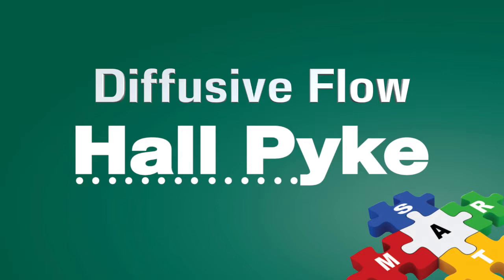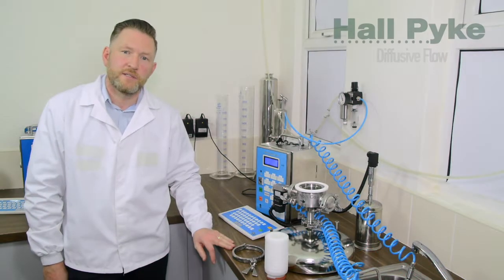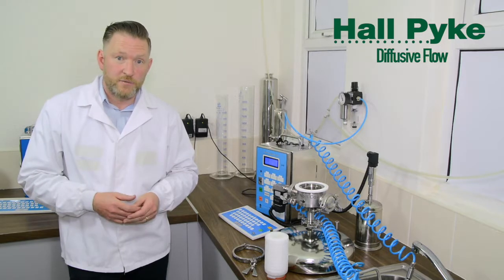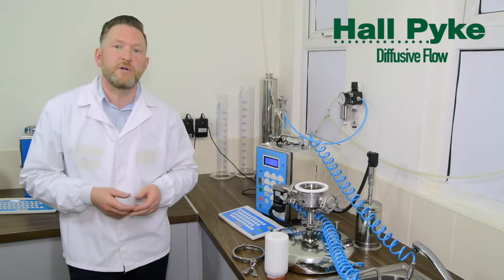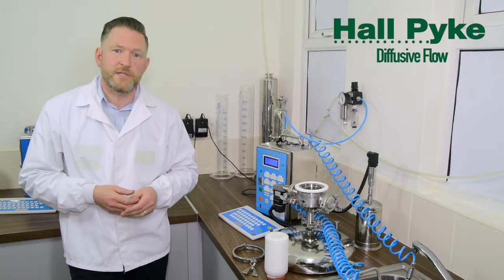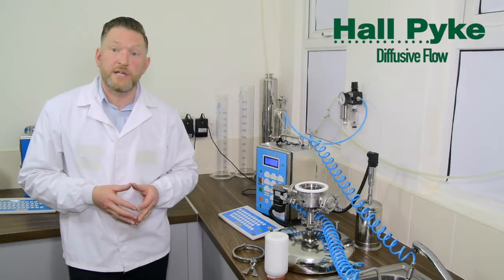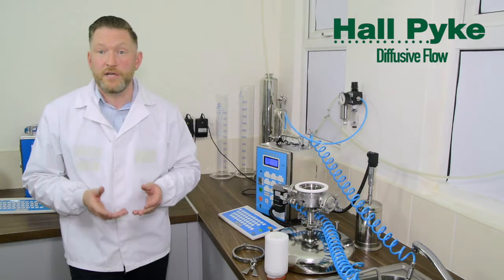Today we're going to talk about Pyke's integrity test services. When a filter is sent in for testing, or if we are testing on site, we must first establish what type of test is required by the customer and the test parameters stated by the filter manufacturer. Determining if a sterilizing grade filter is integral can be done via non-destructive integrity testing.